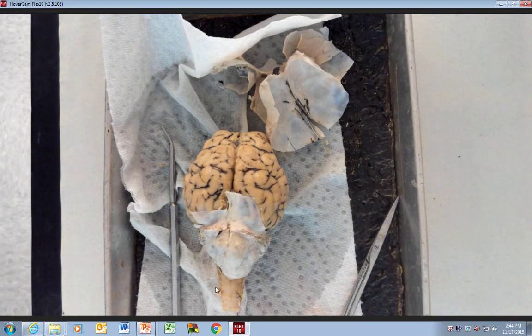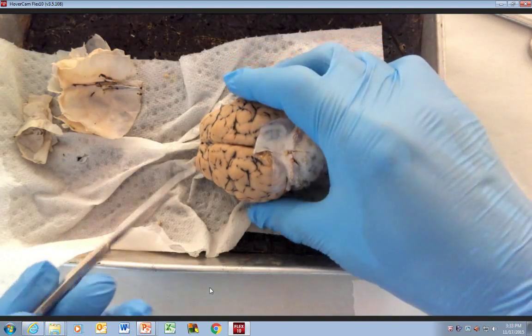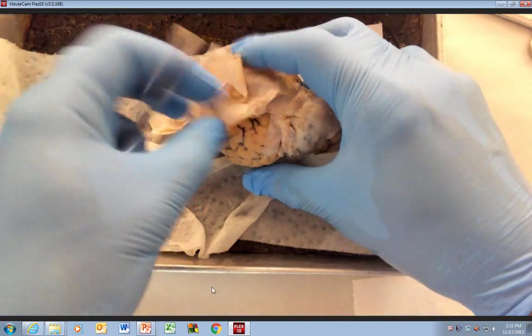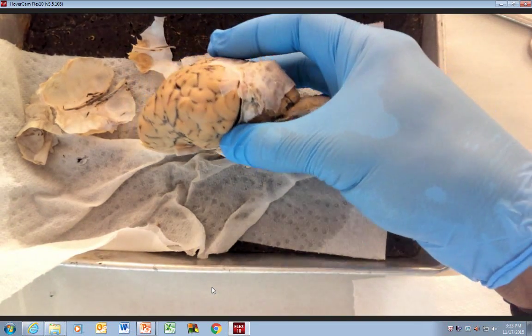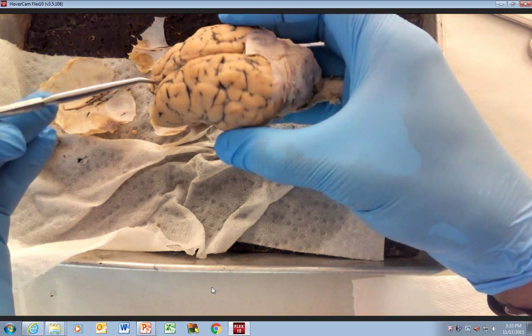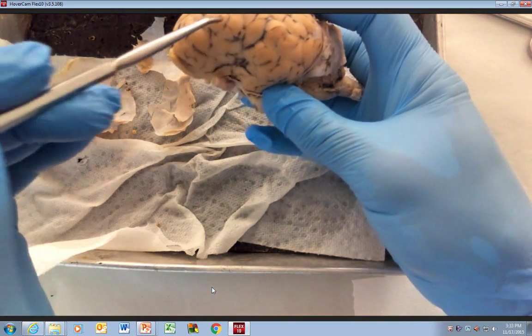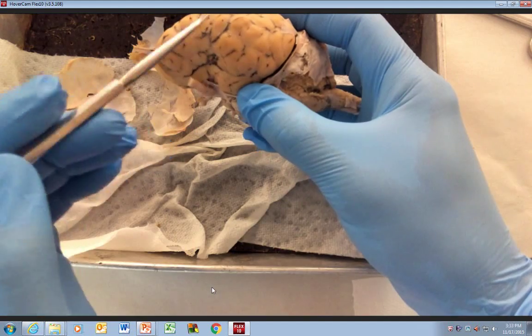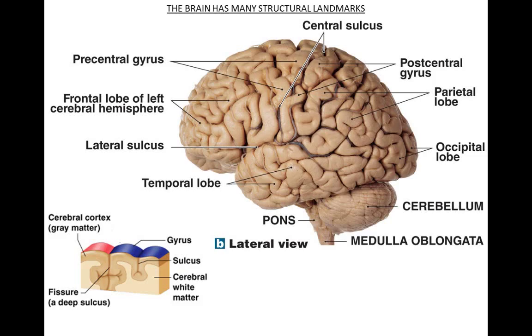All right, so we're back. If we pause for a second — the students removed the dura mater. That's this tough membrane. Let's get a little frame of reference here. What we're going to do is go back and forth between the brain and the PowerPoint. One of the things you can see right here is what's referred to as the longitudinal fissure. Let's talk about gyrus and sulci.